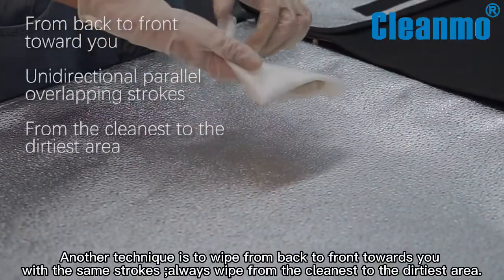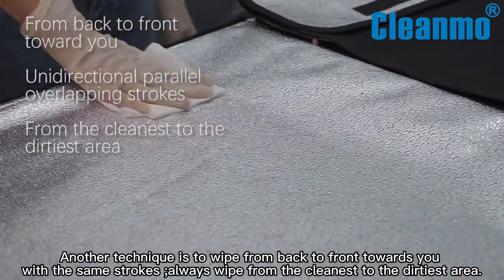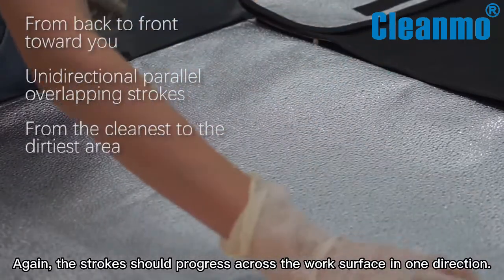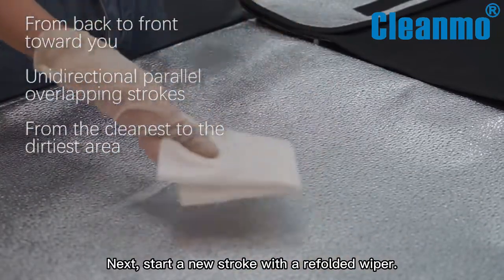Another technique is to wipe from back to front towards you with the same strokes. Always wipe from the cleanest to the dirtiest area. Again, the strokes should progress across the work surface in one direction. Next, start a new stroke with a refolded wiper.